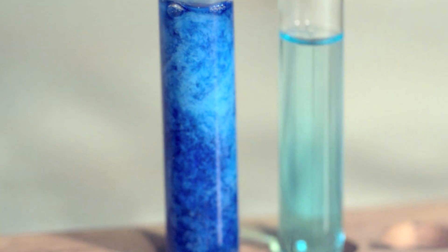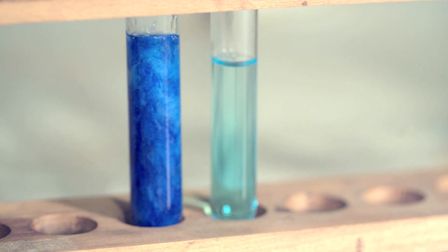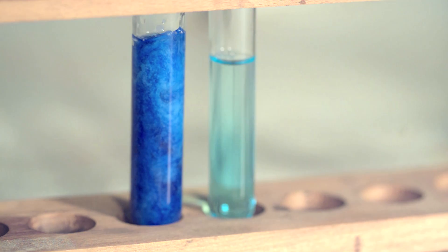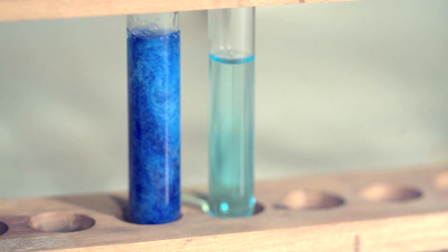My only explanation — and this may well be wrong — is that it takes time for the precipitate to form crystals that are big enough to see. When crystallites are very small, their size is shorter than the wavelength of light, so they appear invisible, though they can still absorb light. As they grow bigger, you see physical clumps of them. This growing of particles can be relatively slow compared to the initial precipitation, which forms really tiny ones.